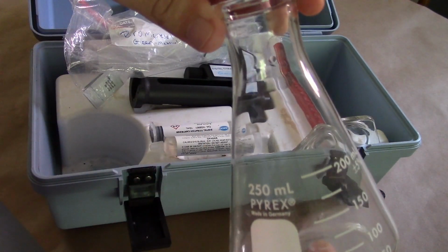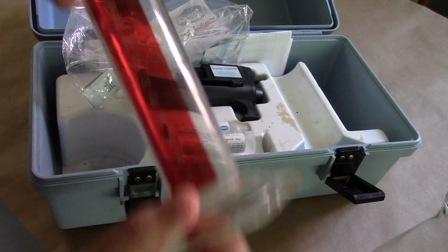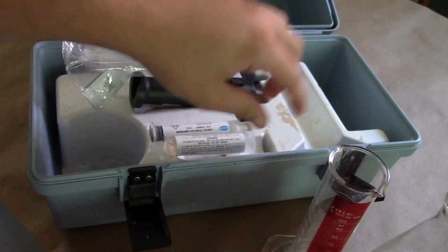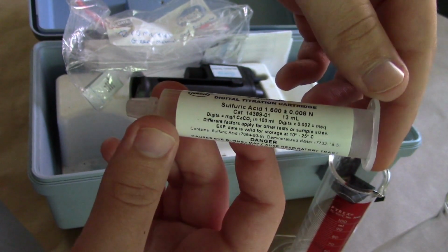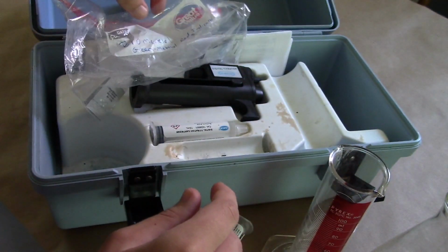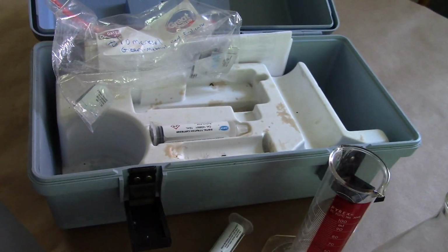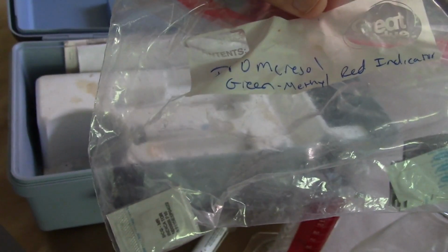We have an Erlenmeyer flask, a graduated cylinder, these little tubes of sulfuric acid of varying concentrations, our digital titrator, and of course the Bromocresol green indicator.